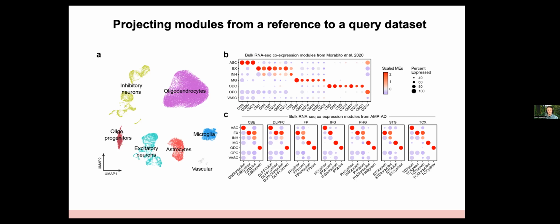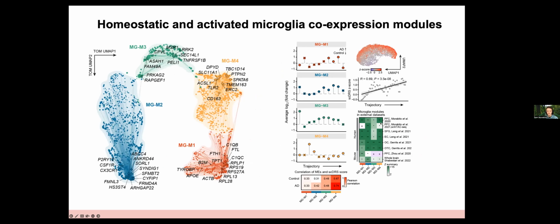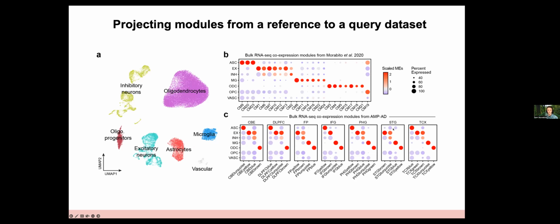We also did, in this one, the module preservation test with our ATAC-seq data set, looking at the gene activity matrix from the ATAC-seq. So this is a pretty flexible analysis tool as well. There's a whole vignette on how to do this in the R package.